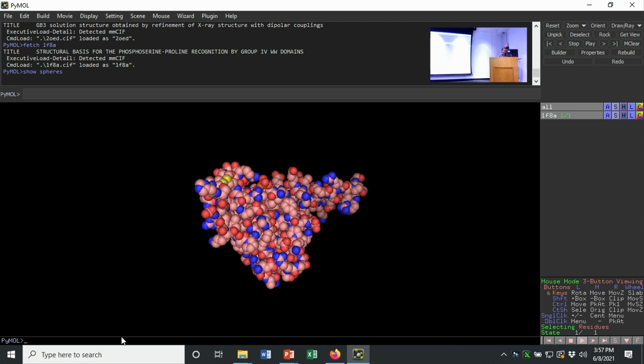And if I go back to my color example, right? I can color everything yellow, but oftentimes I only want to color some part of the molecule yellow. And so this is where the selection syntax comes in for PyMOL. PyMOL has a whole bunch of features that allow you to select specific elements or specific parts of your structure. So in this case, if I want to select only carbons, I can put a comma here and say color yellow, comma, elem C, which means all carbon elements.